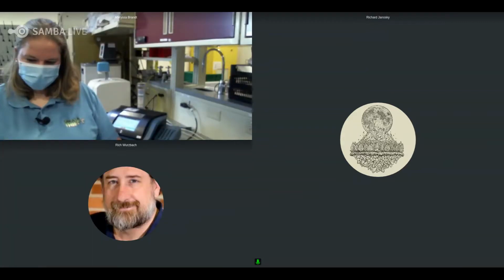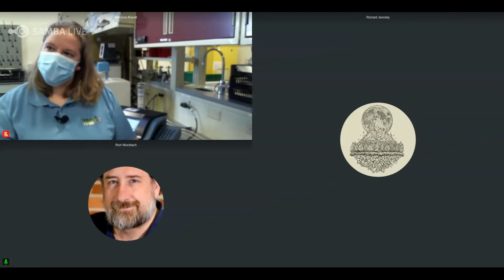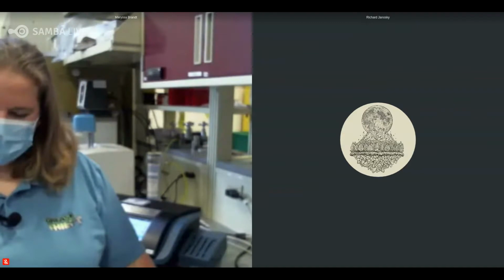Same note, and knowing that David, who asked the question, is a grease manufacturer. Certainly, a grease manufacturer could take a specific formulation and really optimize that for that particular grease to try to have a formula or a profile for the setup of this to really optimize on its behavior to really dial in on those moisture levels. Yes, agreed.